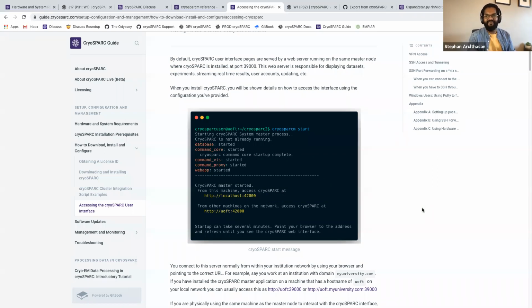Awesome. Can I run CryoSPARC on a MacBook Pro that has a GPU? Interesting. If you have a MacBook Pro with a GPU that works with CryoSPARC, it might be old, because we only support NVIDIA GPUs. And lately, Apple dropped support for NVIDIA GPUs. They only have AMD GPUs. So if you have a fairly old MacBook, yes, technically you can.